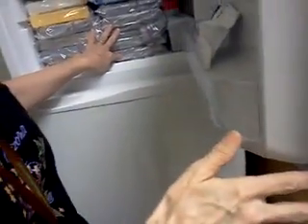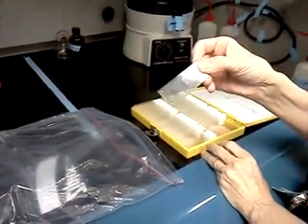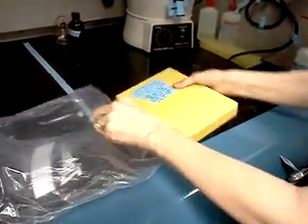So this is what happens to this. At first, you think you're never going to do this. That's why I'm telling you. If you plan to do this for a long time, I think they start adding up, and you save everything. So we put all our sections that haven't been reacted in these boxes, and then we label the boxes. And then that way, we can come in here, and we grab our cryo section and pull out the one we're going to work with today. There it is. Okay. So that's why we have these boxes.